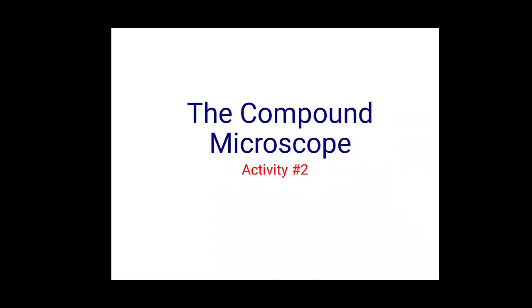Hello future medtechs. So our activity for today is activity number 2, the compound microscope. So objectives for today are, at the end of the activity, the students are able to, number 1, describe and demonstrate how to properly use, transport, clean, and store the compound microscope.